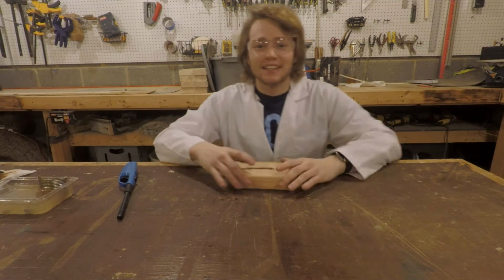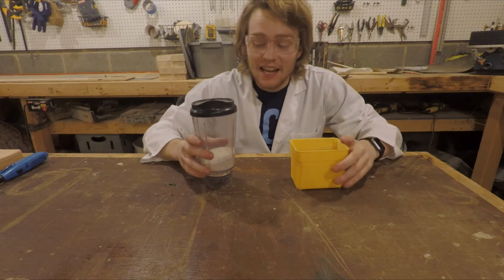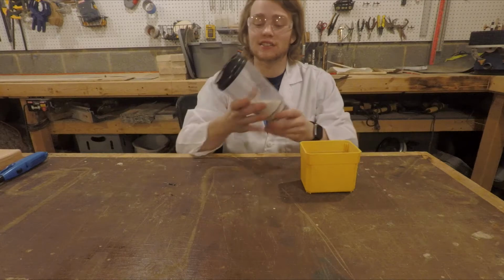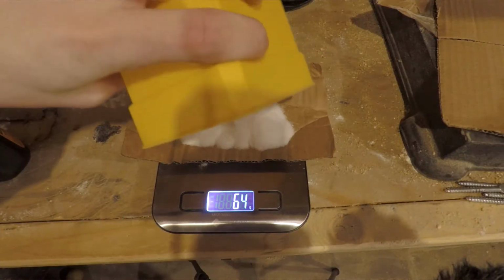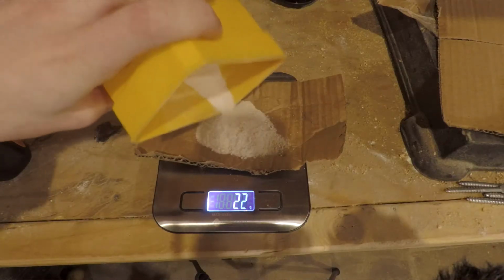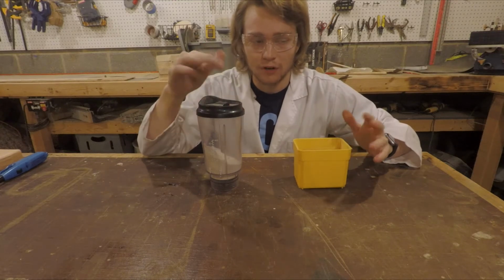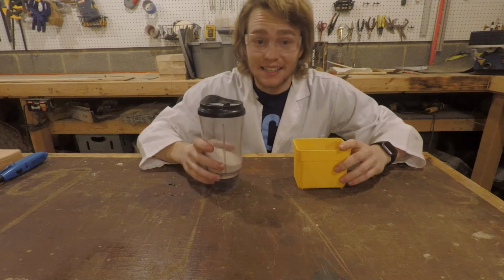Okay. And now for the final oxidation reaction I would like to show today, I have before you rocket fuel. So to make this, I took 65 grams of potassium nitrate, which is an oxidizer in this case, and 35 grams of sugar, which will act as the fuel. And I also have a bonus ingredient just to make it more entertaining, I'll say. So for this reaction, we're gonna need to go outside.